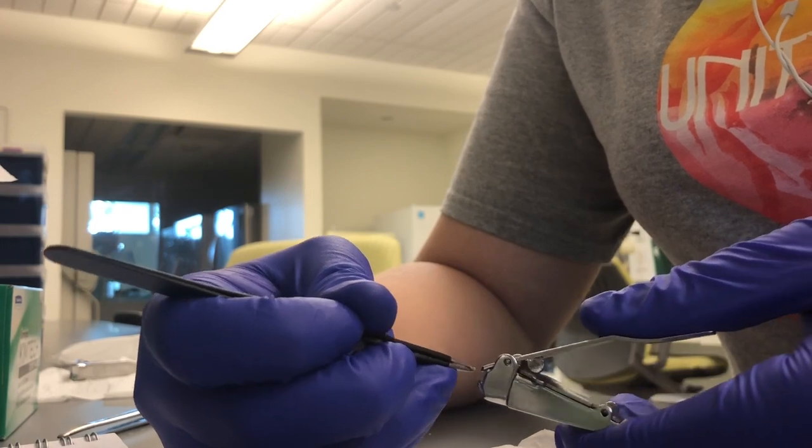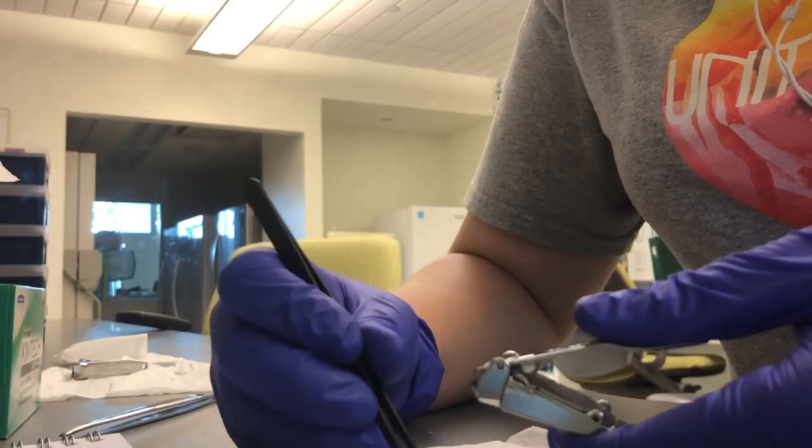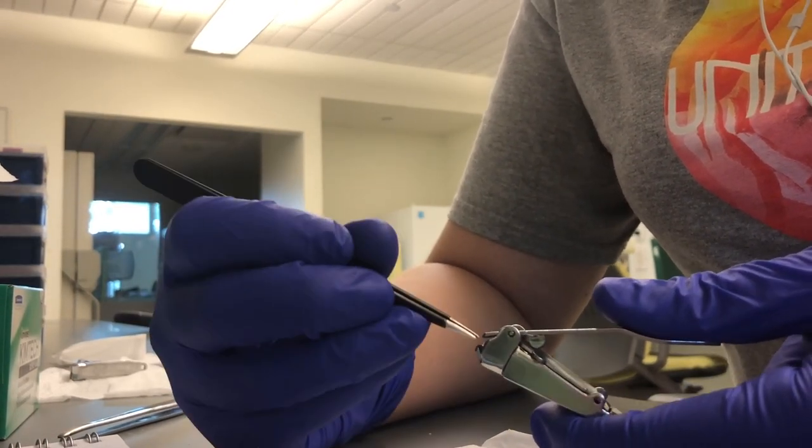In order to avoid contamination, one pair of clippers was used per individual sample. Once the spines had been clipped and were contained in the clipper compartment, they were then transferred into extraction tubes.